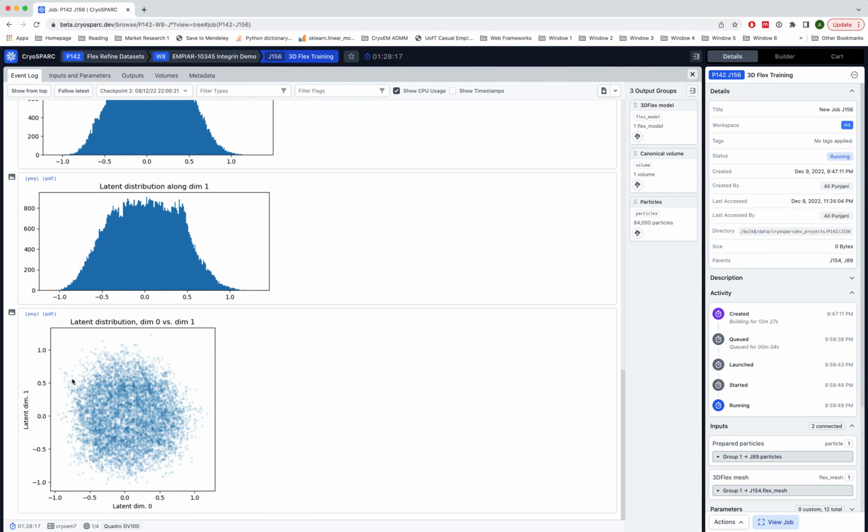So these latent distributions are good, and beyond that, the centering strength does not really matter, since the 3D Flex model has complete control, or rather, it is able to learn any pattern in the latent space and then map that into any pattern of deformation. So if we squish or stretch the latent space a little bit, as long as the flow generator also learns a corresponding change, the deformation model overall can model the exact same motions.